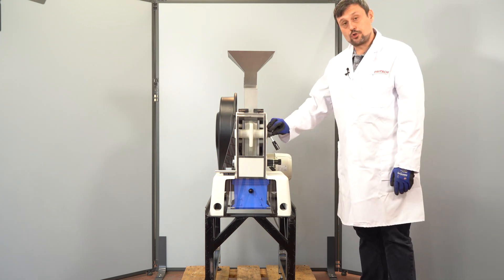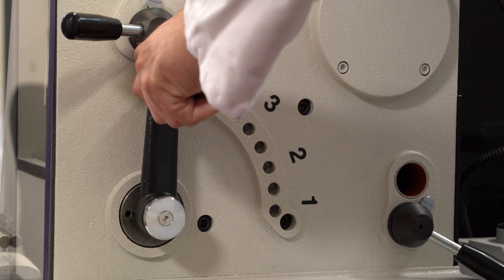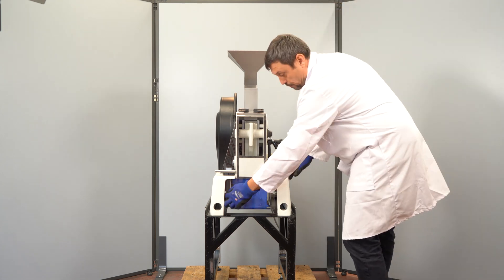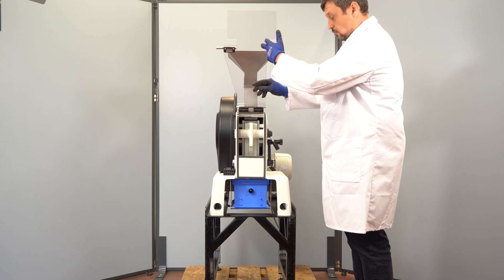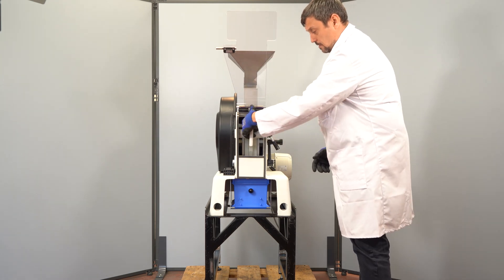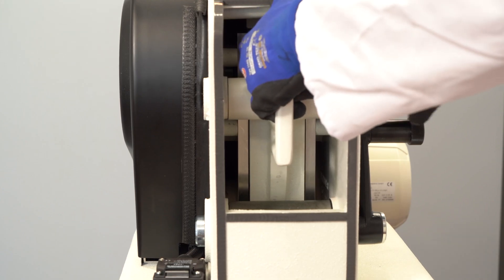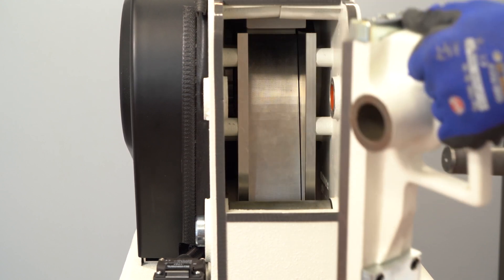To remove the jaw, set the biggest gap first. Then open the securing door. Support this jaw with your thumb as it is very heavy, fix it on top, and remove it.